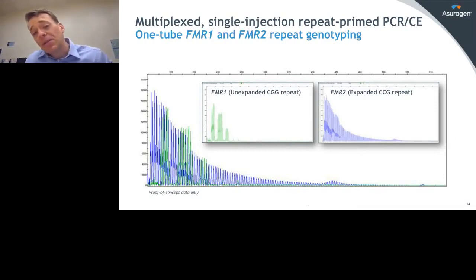I will point out this is an unusual sample because the full mutation is unmethylated in this case. We see those rarely, but we do see those. It's a function of the nature of this particular sample. But normally what we would expect to see with a full mutation is that it's fully methylated. But the important point is that we can then quantify that relative methylation as a function of each of the alleles.